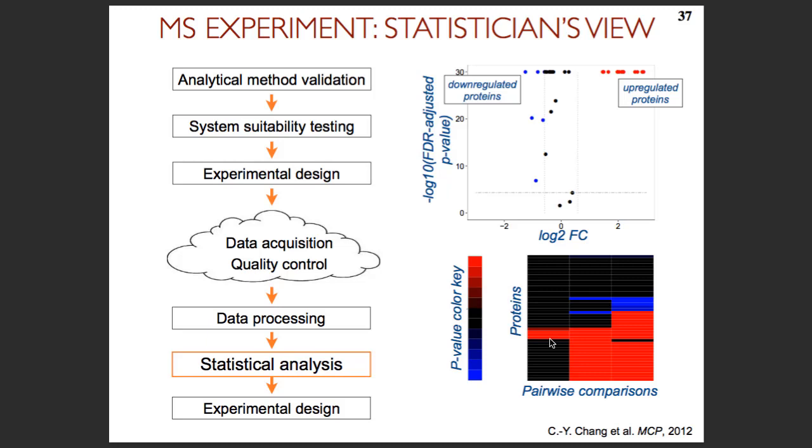Those of you who were here last week remember that we would need some kind of statistical models which describe the variability in the data after normalization, and we will use these models. Last week, we talked about assuming independent replicates and normal distributions and things like that. We would need to build quantities from the data, such as signal-to-noise ratios, which allow us to say this signal is larger than the random variation due to noise, right? And we had some criteria to decide how large is large, and this can be characterized in terms of p-values.